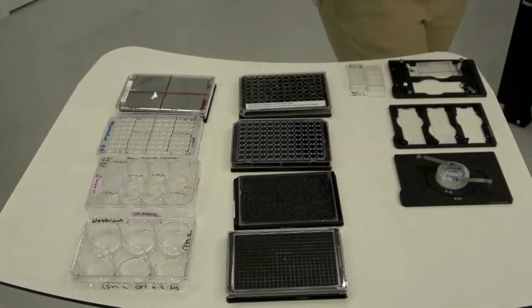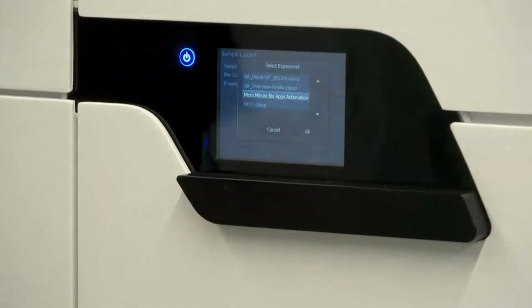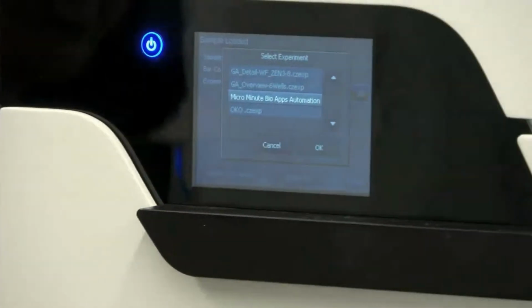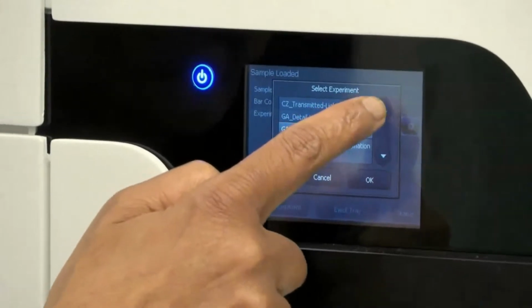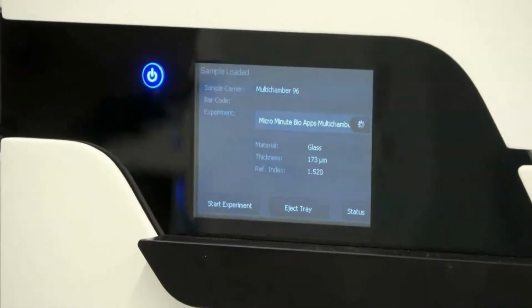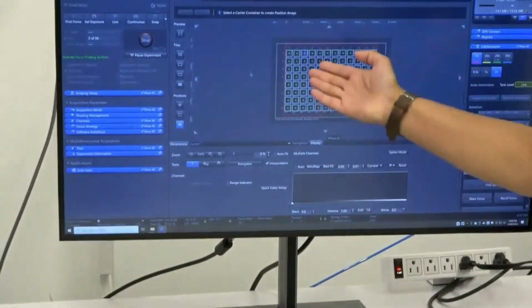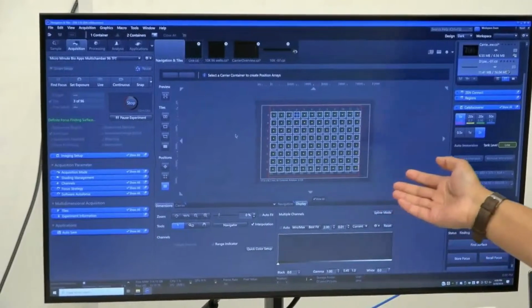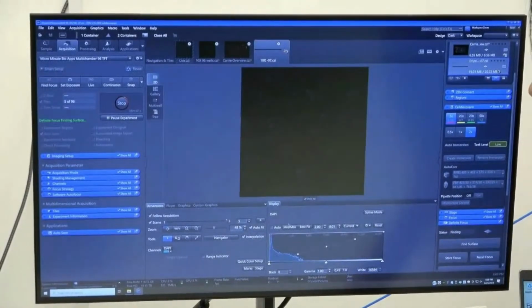So it looks like the instrument has finished recognizing our plate. This panel right here has a drop-down menu of all of the experiments that have been configured on the instrument. So if it's an experiment that you run day in and day out, you could just select that experiment from this menu, click OK, and start experiment. What you see happening up on the screen, Michael, if you can pan again this way, is the experiment starting, and essentially I have one position per well in all of the 96 wells in the 96 well plate. And so it starts imaging just nuclei in this case.